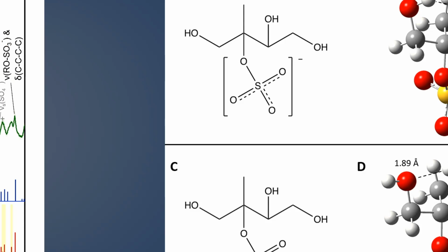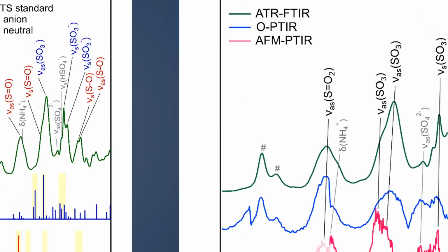Here, we've known the Raman peak for these organosulfates was roughly in the 1075 wavenumber range, but we didn't really know where the IR was. And that's where we were excited. So we took some of our pure sample and looked at it with your workhorse ATR-FTIR, but it takes a bit of material, and it's not actually what's in the aerosol phase, right? It's just what we're getting from the synthetic products.